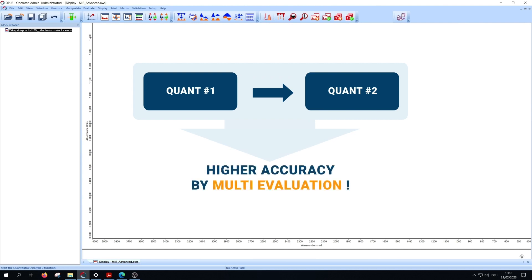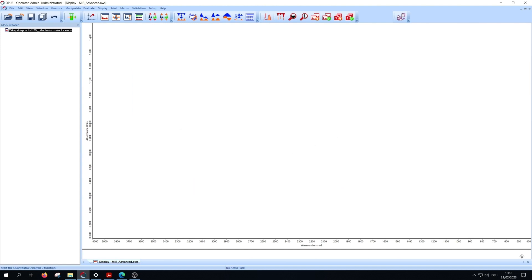This can be used if the sample gets first quantified by a method which covers a large concentration range. To improve the accuracy of the prediction of the first method, the analyzed component can be evaluated by a second QUANT2 analyzer with a more suitable concentration range.